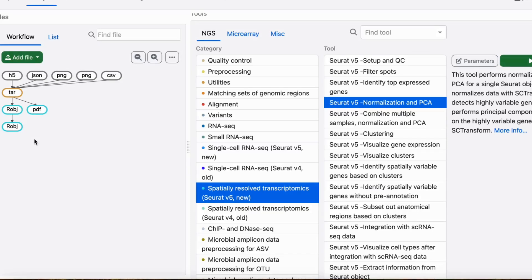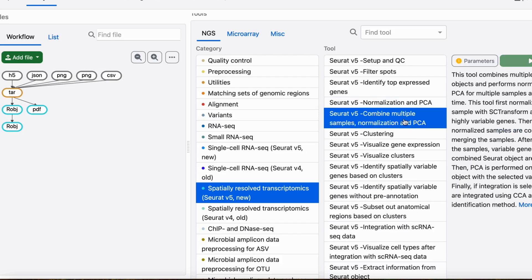Now, let's take a look at how to use this tool in Chipster. If we only have one sample, we can use this normalization and PCA tool for this step. If we have more than one sample, we can use the combined multiple samples normalization and PCA tool, as this also includes a method to combine the samples. We will go through this in more detail later, but for now we will only look at the analysis with one sample.